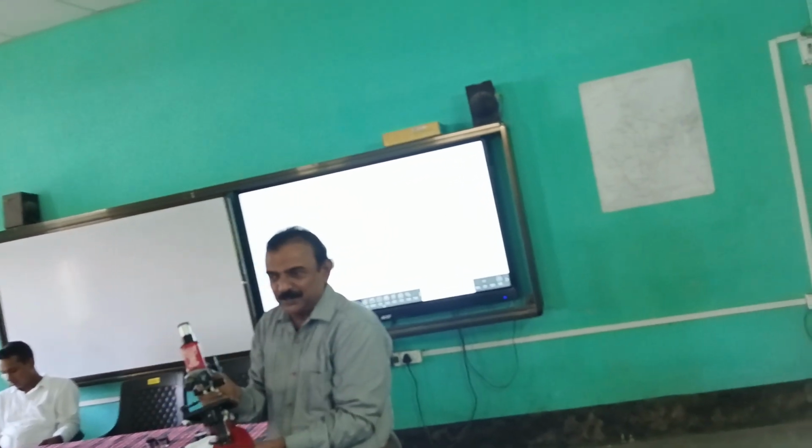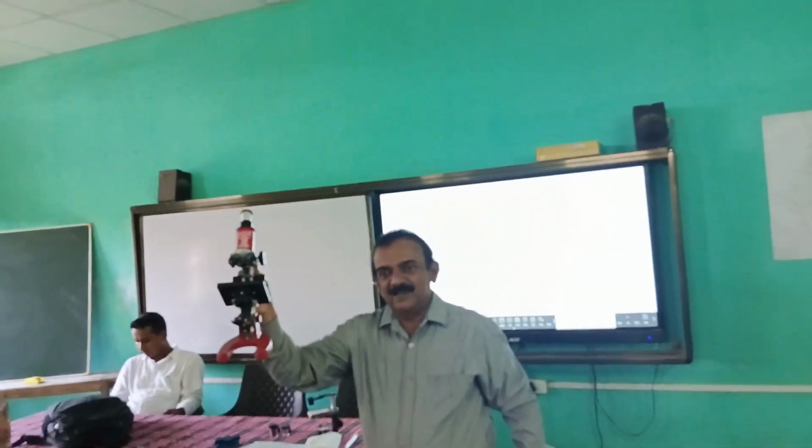So I request any one of you, please come and explain the parts of the compound microscope. Anyone? Anyone?